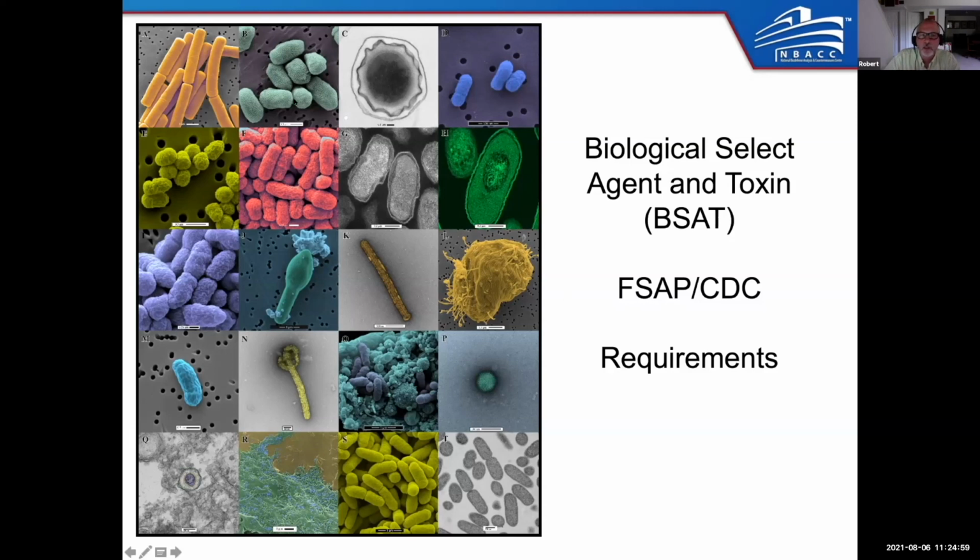So this is actually the image that I made for the abstract for this talk. Top left, you have the Bacillus anthracis, which makes the anthrax spores, with SEM here and TEM right here. All of these organisms are hazardous to our health, okay? This is actually a picture of an Ebola virus in panel K here. And you typically see Ebola virus on the internet.